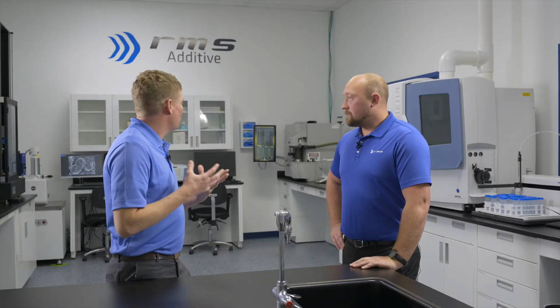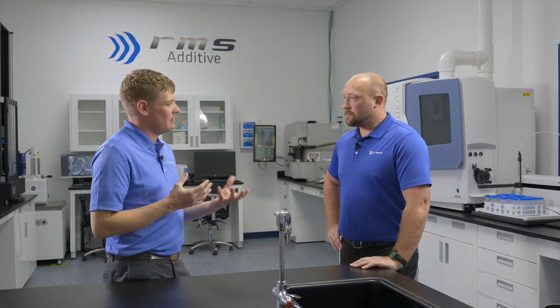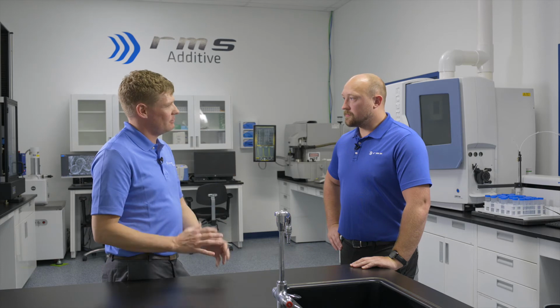You mentioned that you use the lab to help you work better with the additive manufacturing group. Can you give me an example of when you guys have done that? Yeah, so right now we're doing an oxygen powder life study to help us determine when we should be switching out our powder in our actual printing machines more regularly, so we don't have any risk of failures due to oxygen content.